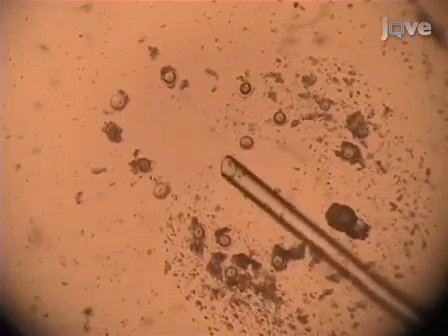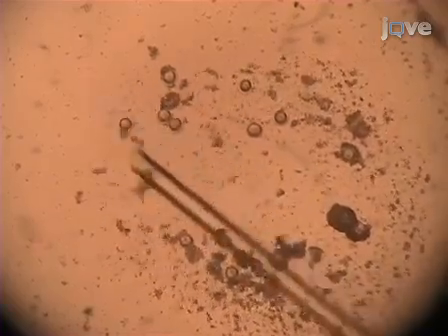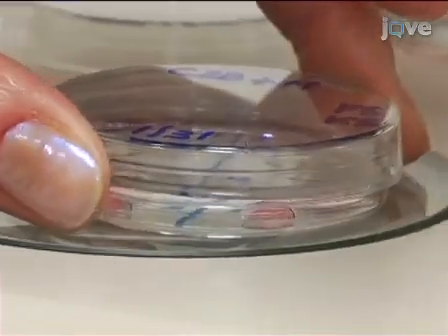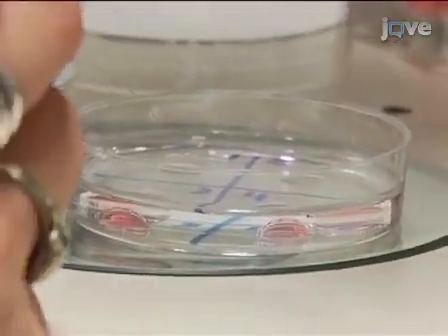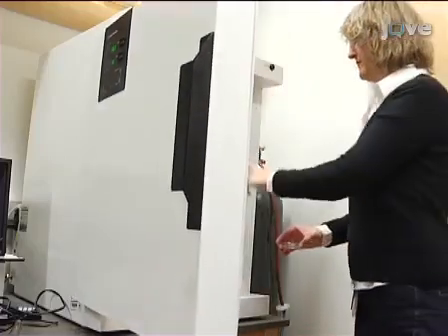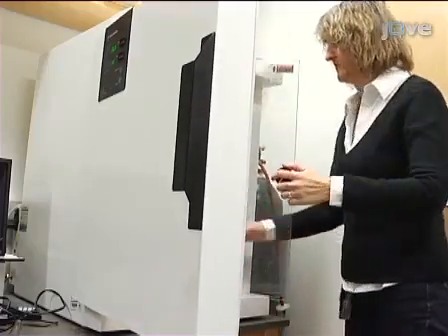Transfer the complexes to a microdrop of prepared collection medium. With a small pipette slightly larger than the diameter of the oocyte, detach the cumulus cells from the complexes. Transfer the denuded oocytes with a larger pipette into a microdrop of culture medium. Allow oocytes to recover for at least 1 hour in the incubator prior to manipulation.